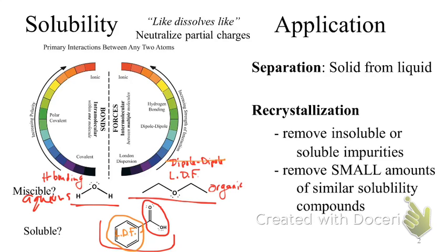You guys went through and did a recrystallization with benzoic acid last week, and you used water as your recrystallization solvent. The reason water worked was because we could change the solubility, and primarily it was insoluble. That's how you got your compound back out. So we do have the experimental evidence to support what we're guessing at here. So the idea now is that in an extraction, we want to cause that compound, our benzoic acid, to switch from being organic soluble to becoming aqueous soluble.